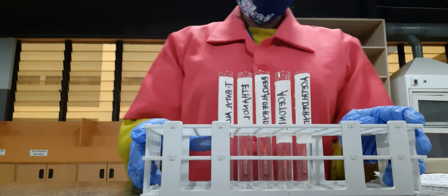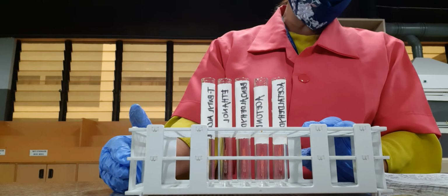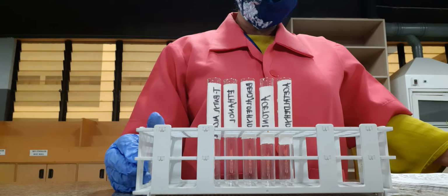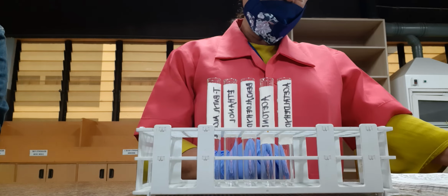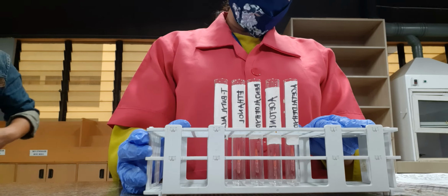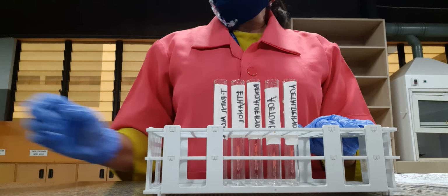Okay, here. So once again, our second test will be using the oxidizing agent, which is Fehling's solution or Fehling's reagent. Okay, so we have Fehling's reagent, and this is intended also for the detection of acetaldehyde. Okay, only for the detection of acetaldehyde. So Fehling's reagent is a deep blue solution containing cupric ion, and cupric ion will be reduced to cuprous ion when it reacts with acetaldehyde.